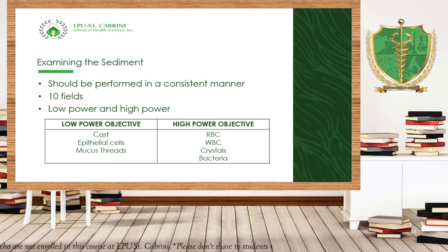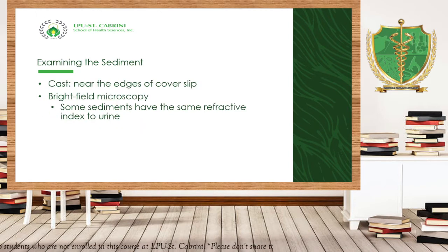For high power objective or HPO or HPF, you're going to detect the presence of RBC, WBC, crystals, bacteria, yeast will also be seen in the high power field, as well as the presence of parasite if there is. Okay, so this is what I am telling a while ago, the examination of the sediment for cast is usually done near the edges of the cover slip.